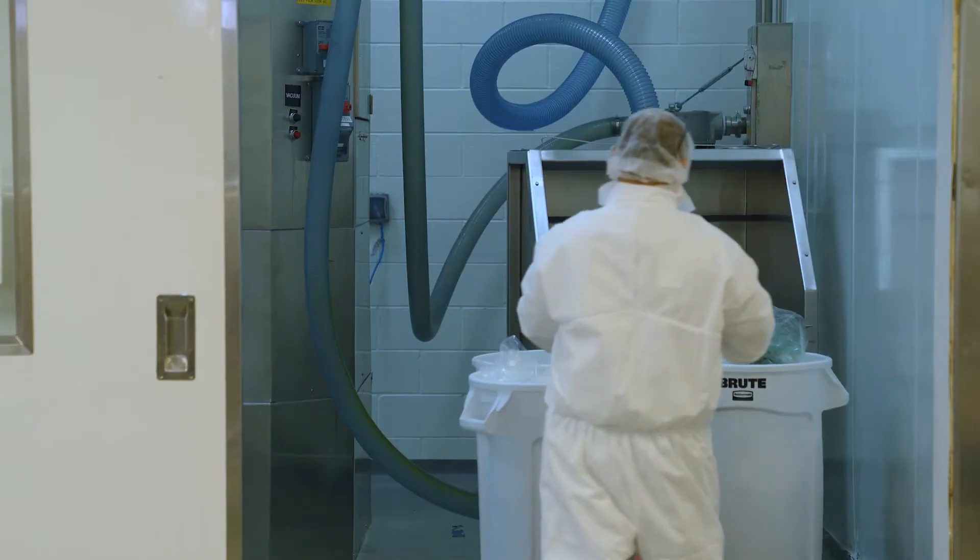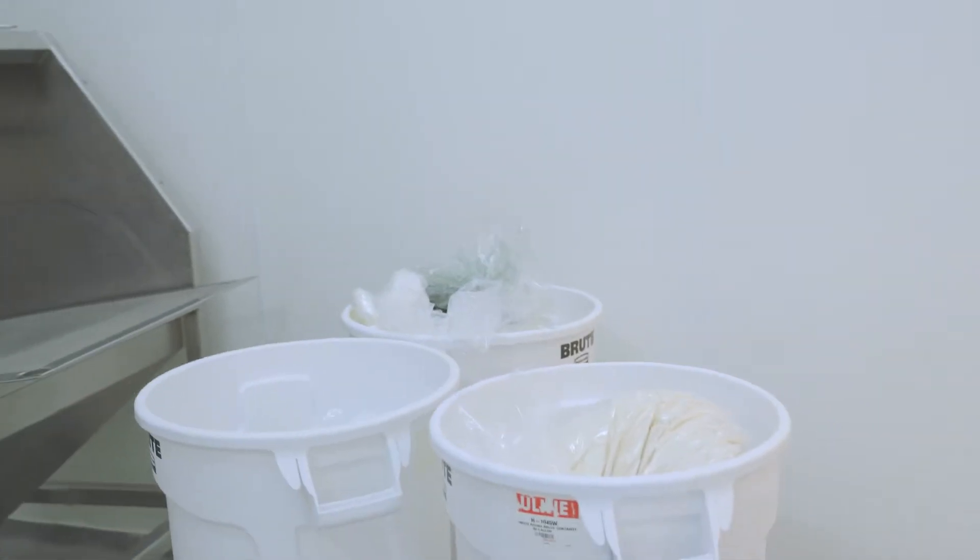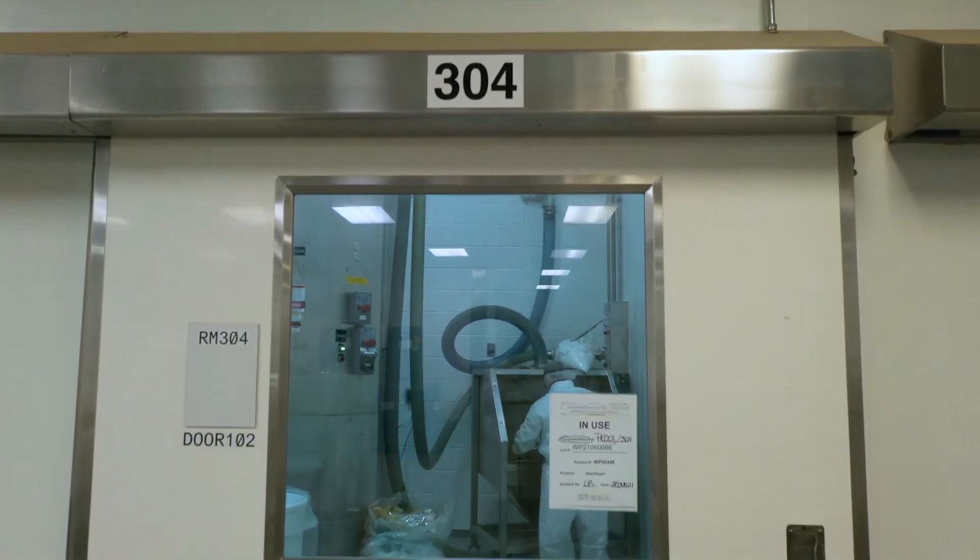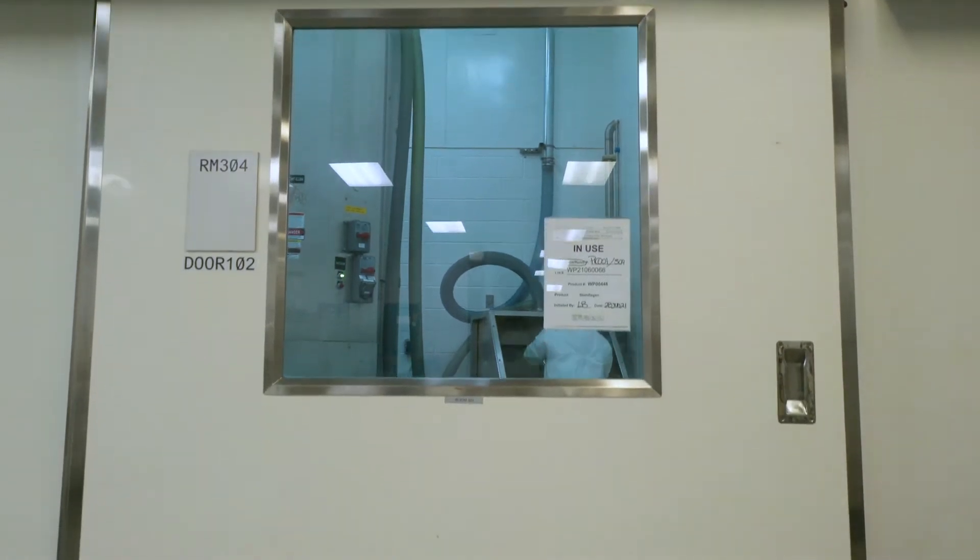Ingredients are fed one by one through a sieve to ensure that no debris of any kind can find its way into the finished product.